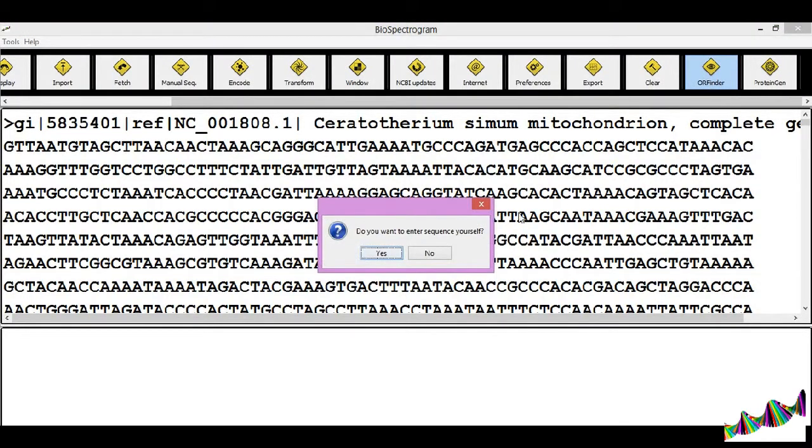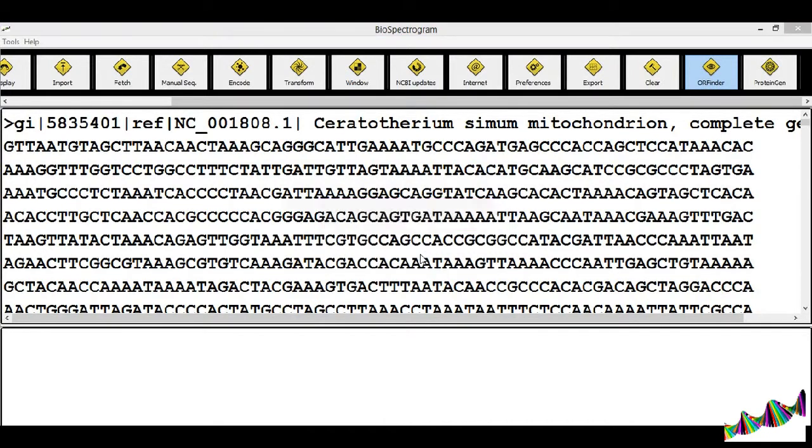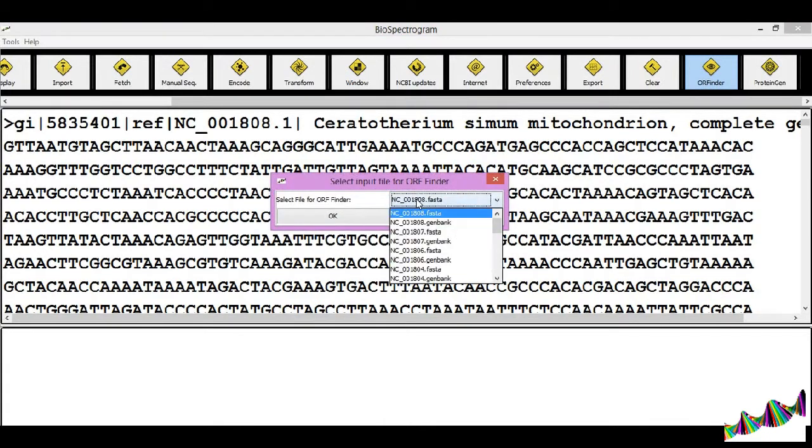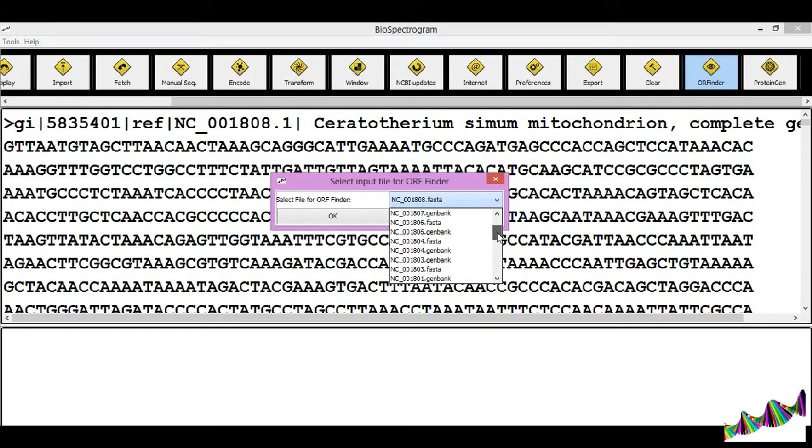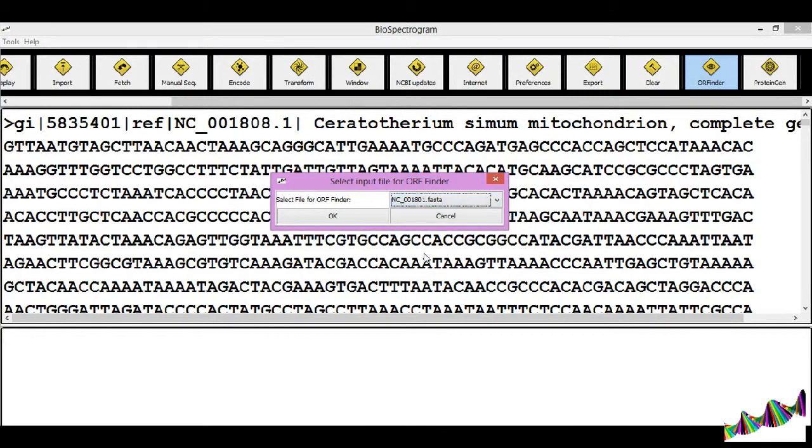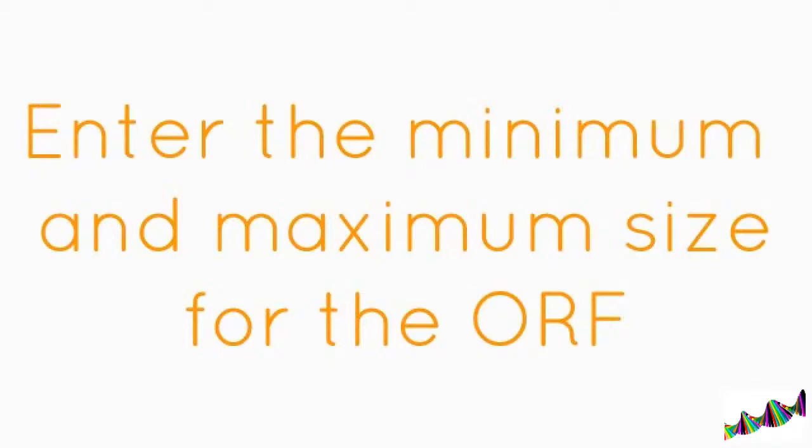A dialog box displays asking you whether you wish to enter the sequence manually or select a file. Select the file for which you wish to find the ORF. Click on OK.